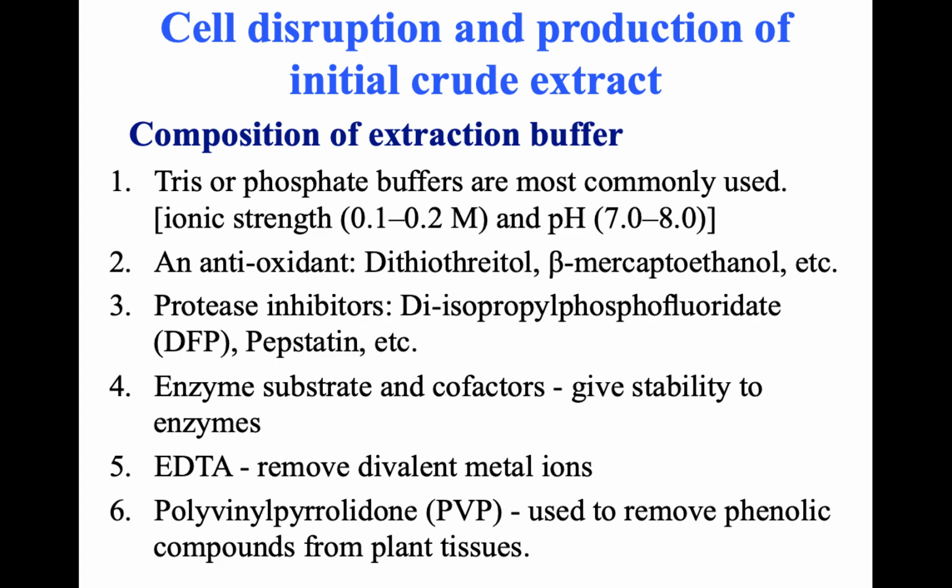At the same time, after the cell lysis, these phenolic compounds are oxidized by the enzyme called phenolic oxidase and form quinones. These quinones readily react with the proteins and form cross-links between the proteins, ultimately resulting in protein aggregation.